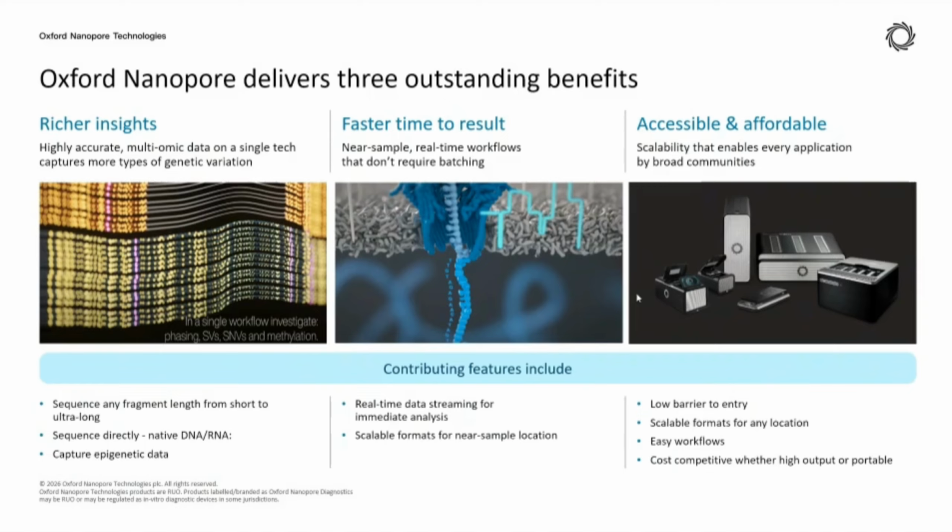The outstanding features of Oxford Nanopore sequencing are that it can provide more insights.